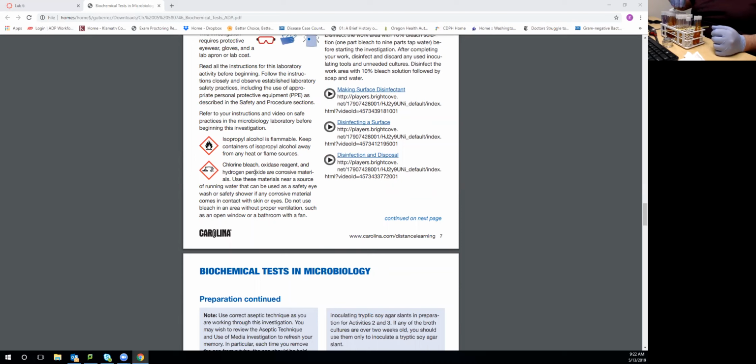Okay, so you should have 3 of those, and what you're going to do is inoculate 3 TSI tubes. Now, mark your tubes before you inoculate them. I'm noticing people are making mistakes in which they're adding microorganisms when they're not supposed to because they lost track of what they're doing. Label your tubes first, then add your microorganisms. Otherwise, you're going to make mistakes, okay? So once we have your 3 microorganisms, I'm going to simulate how to do it here, okay? That's the whole purpose of me doing this little presentation. So you're going to take your little baby lamp here, okay?